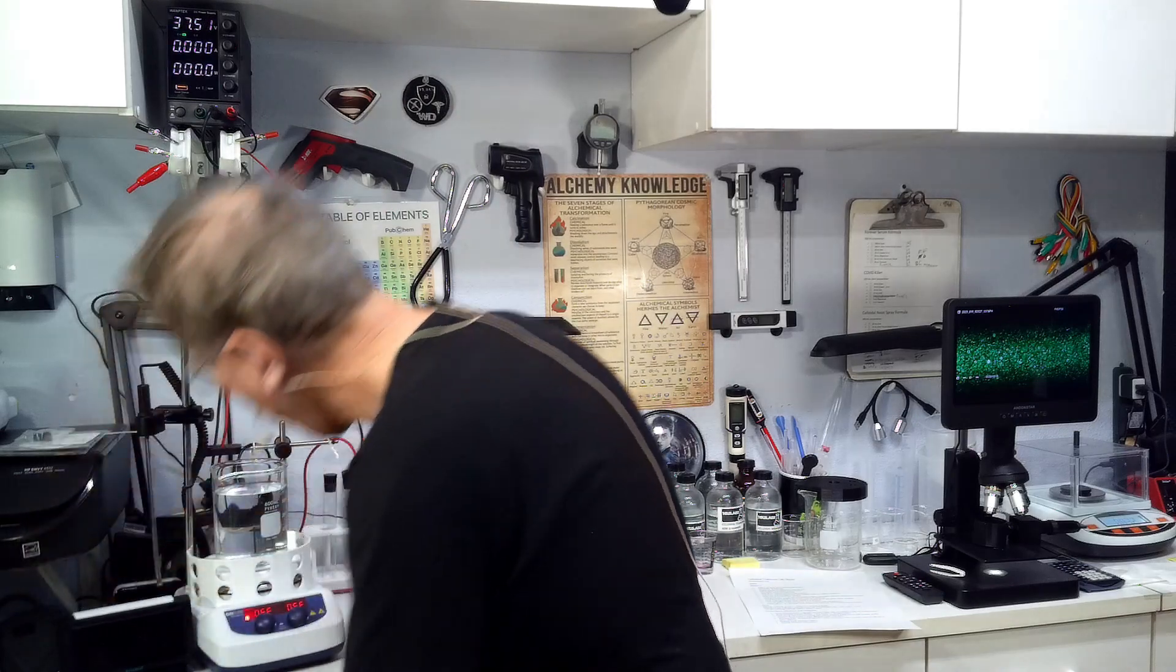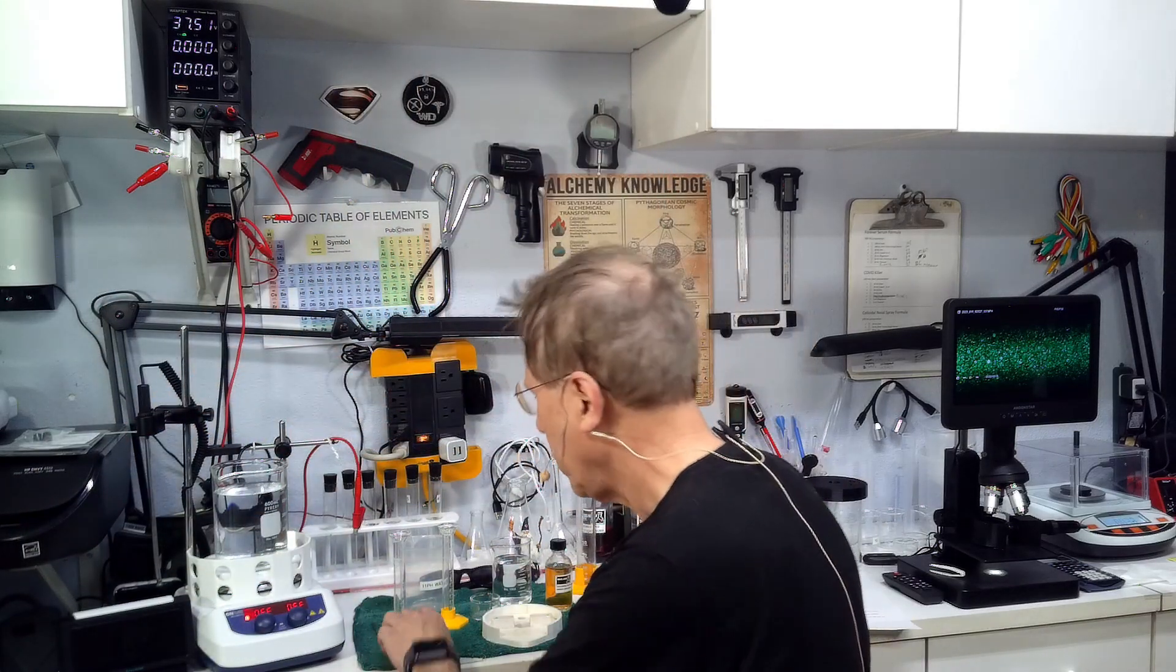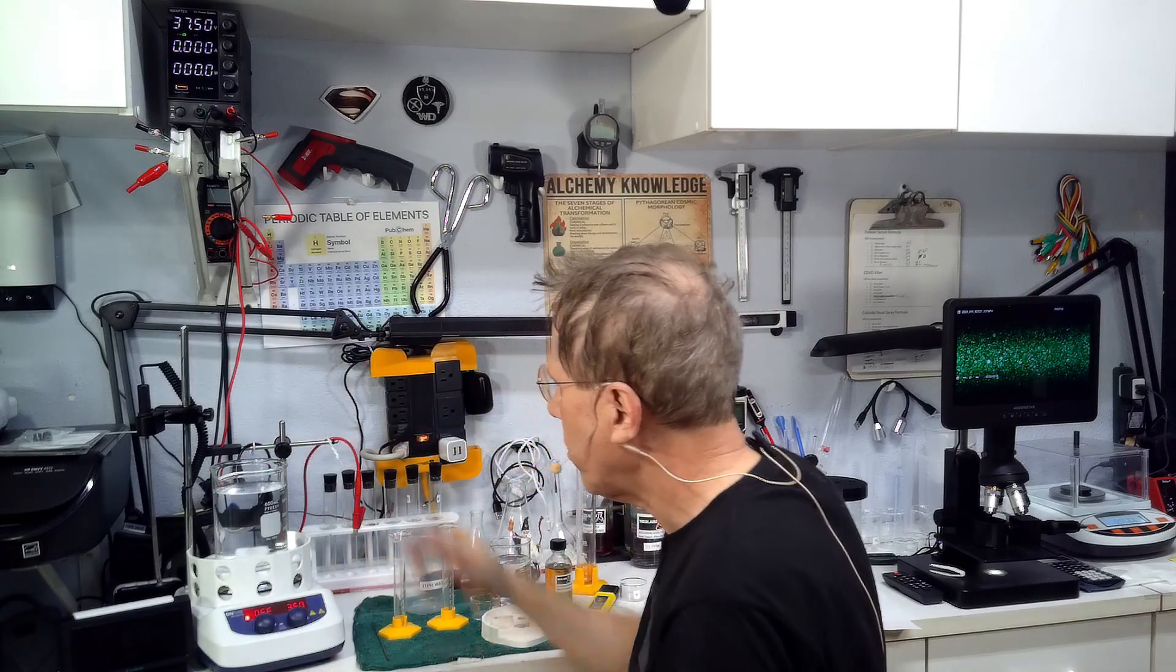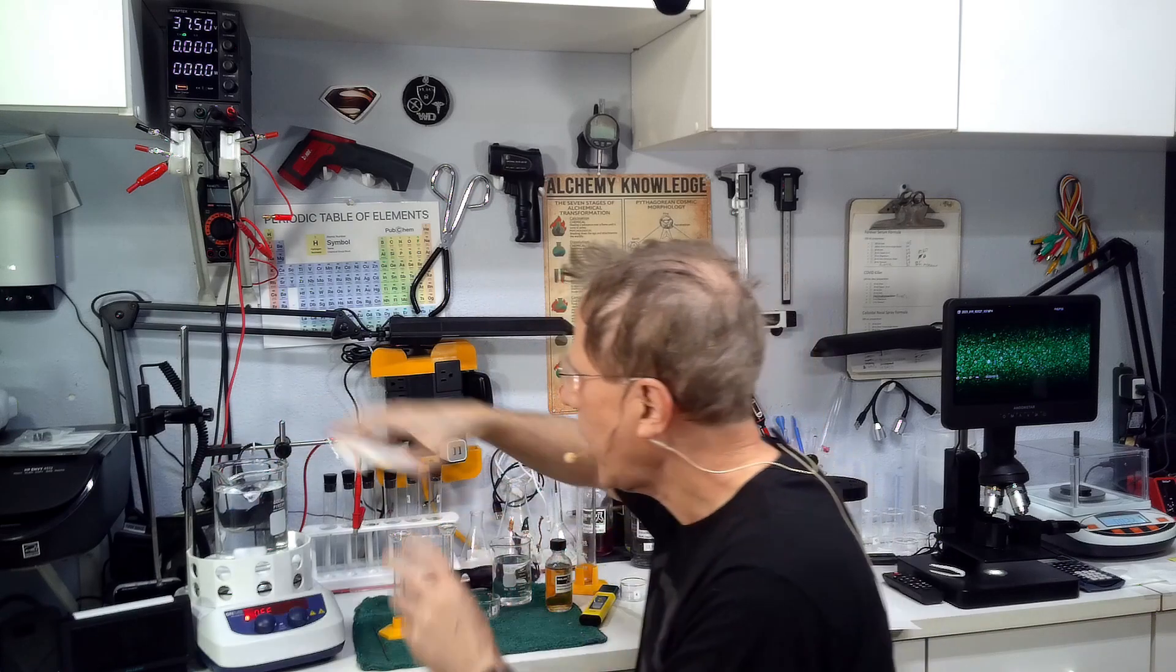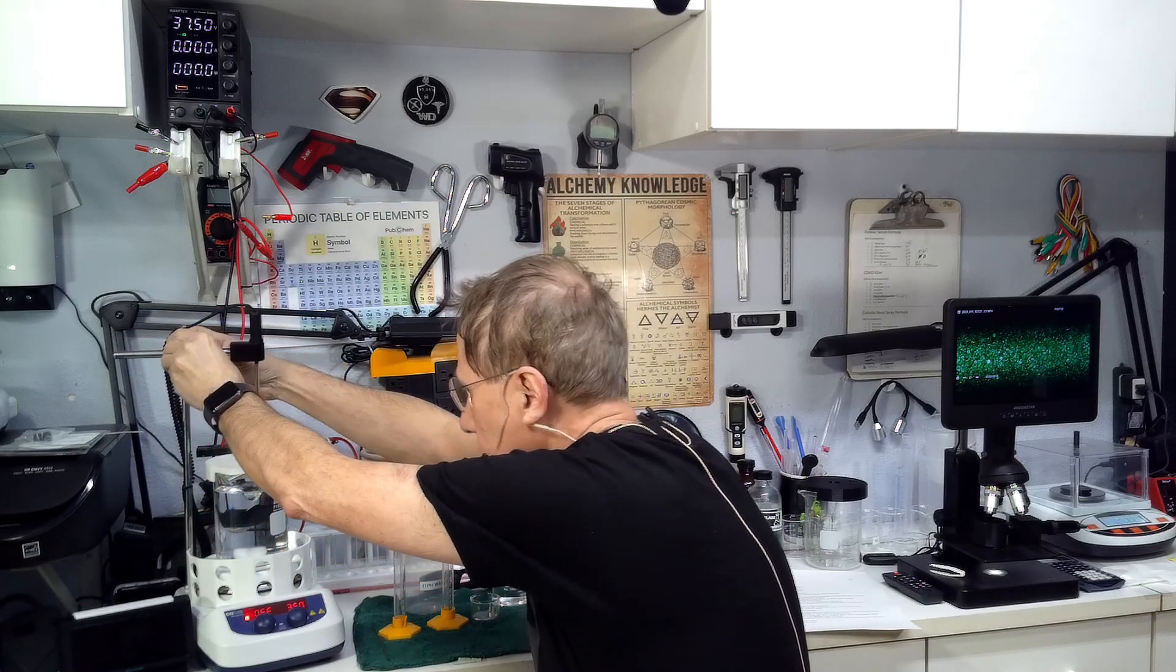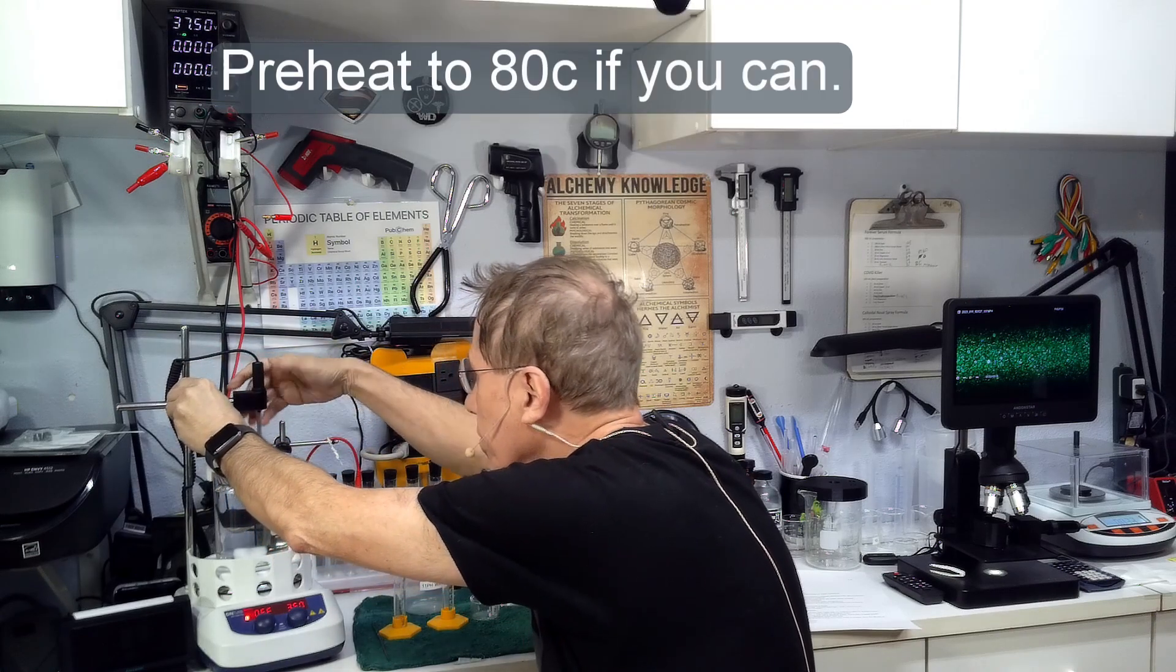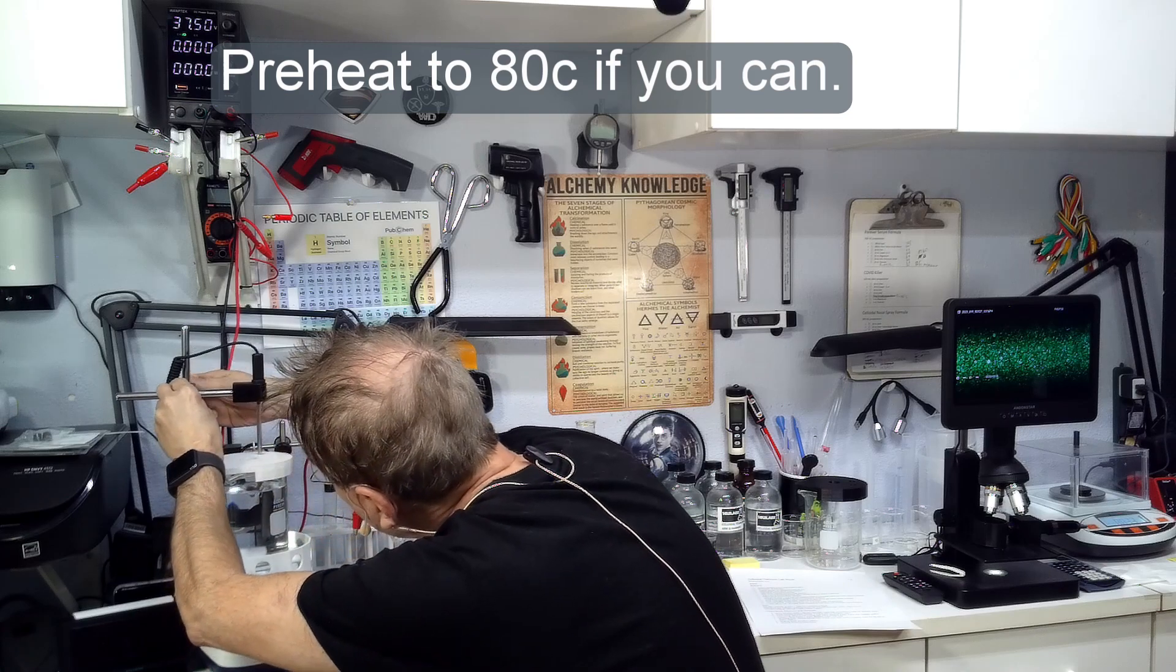We're going to fill our stirrer beaker with 500 milliliters of fluid. I'm going to drop the stirrer in and turn that on. Now I'm going to put my top on here and put my temperature probe in there.